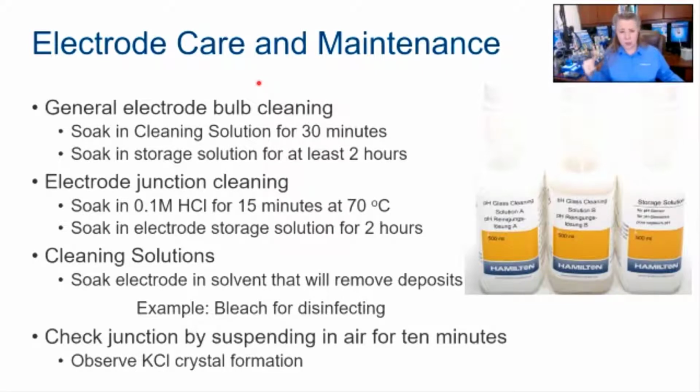Then rinse it with DI water and soak it in storage solution, which is just 3 molar KCl, for 2 hours minimum. That soaking is required to rehydrate the gel layer and to rebalance and re-equilibrate everything.